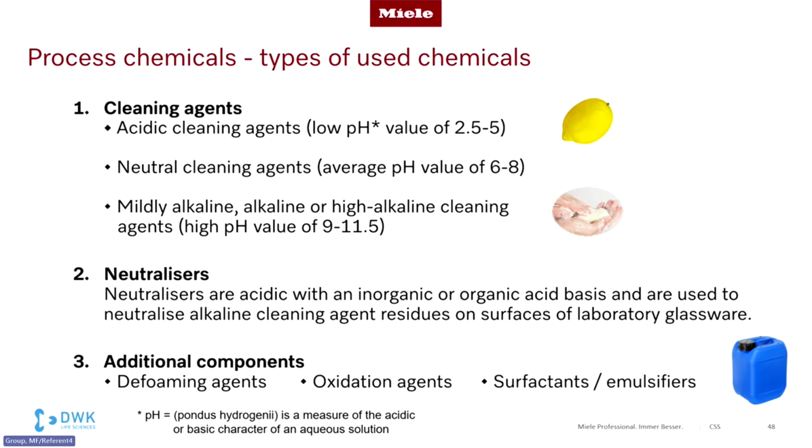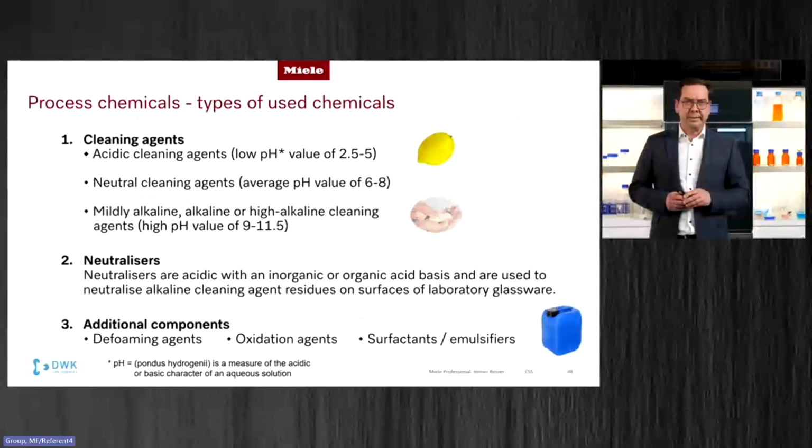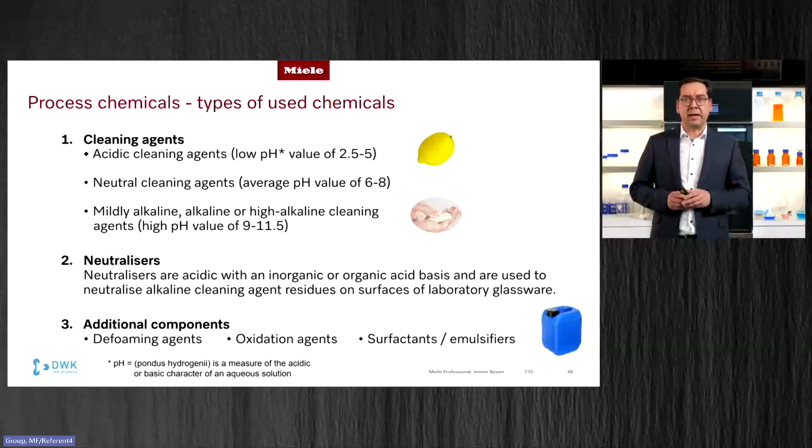And last but not least, I would like to mention very briefly that there are additional components, for example, defoaming agents, oxidation agents, or emulsifiers. These are additives that might be needed to stabilize the whole process.